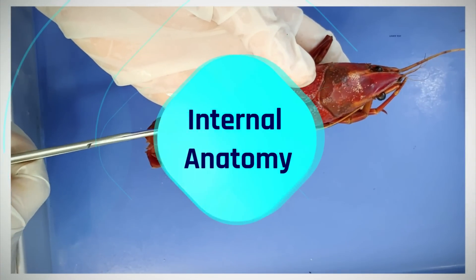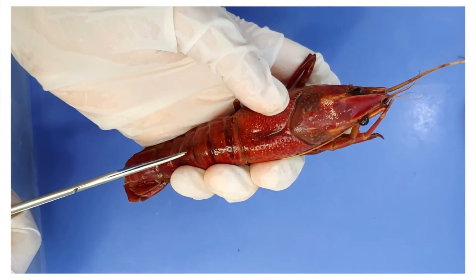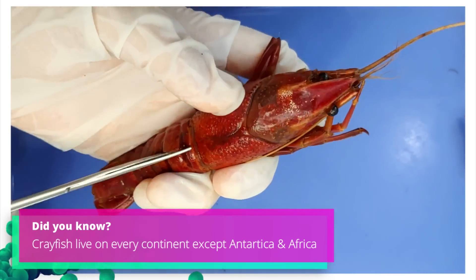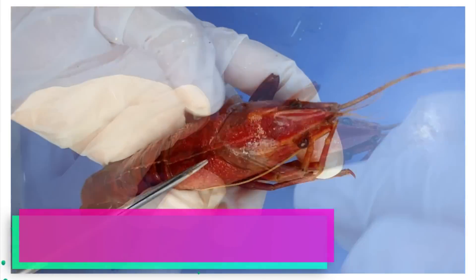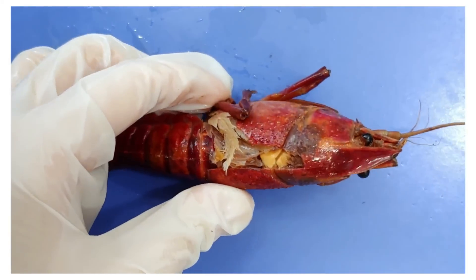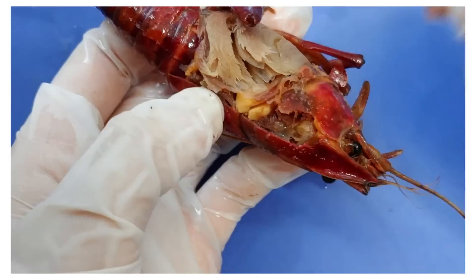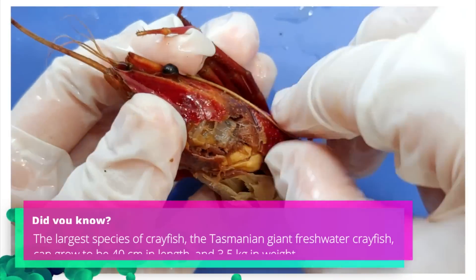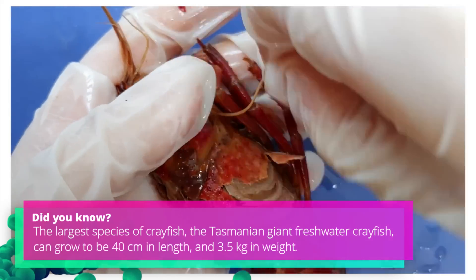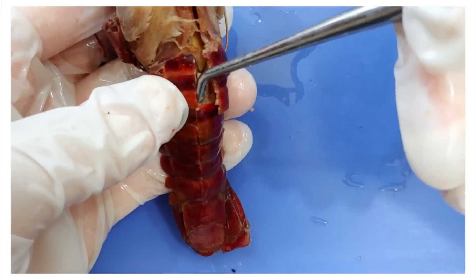Now let's get into the internal anatomy. I'm going to get my scissors in here and carefully cut along the dorsal side. Take care to only cut the top, and angle your scissors up so that you don't damage any of the internal structures. Now I'll pull the exoskeleton away gently, using the probe to detach the muscles that are attached to the exoskeleton. Be careful when you pull it away to avoid damaging the internal structures. You can do the same thing to the abdomen here — just pull away the exoskeleton from the internal flesh.